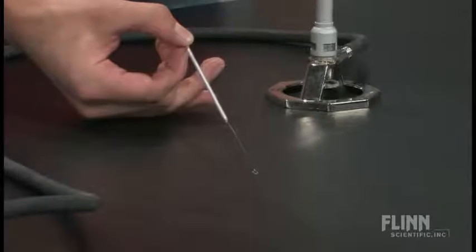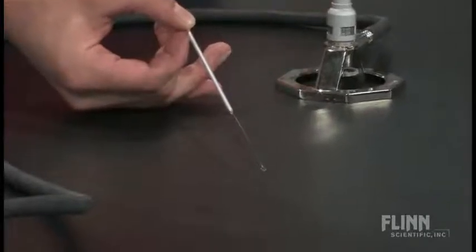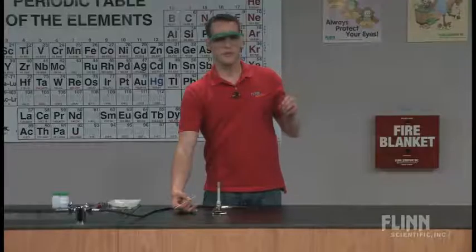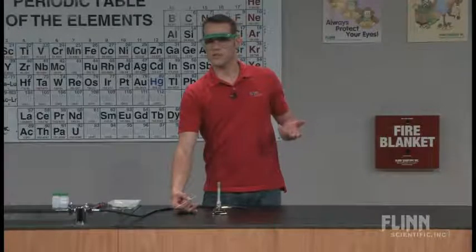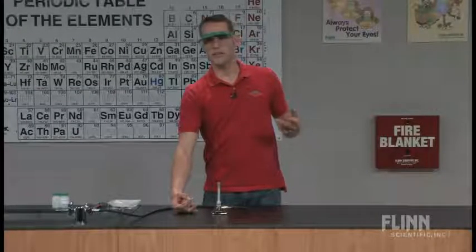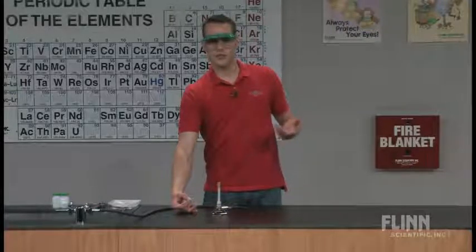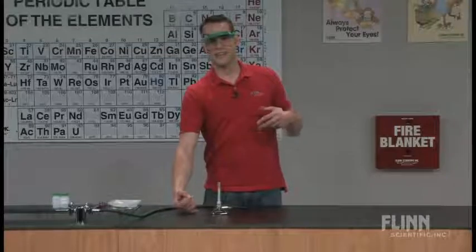The platinum wire or nichrome wire that's used, they dip into water and then try to capture a little bit of a salt crystal or dip it into a solution of the salts that you want to use for the flame test. And then to clean this off, you have to dip it into a fairly concentrated solution of hydrochloric acid and then heat it in the flame.